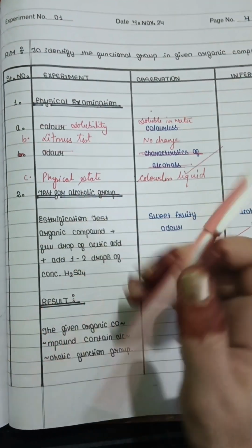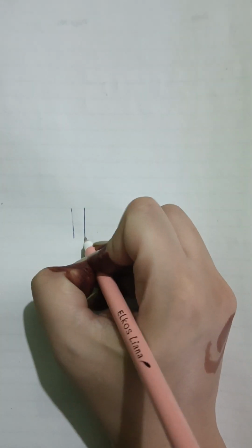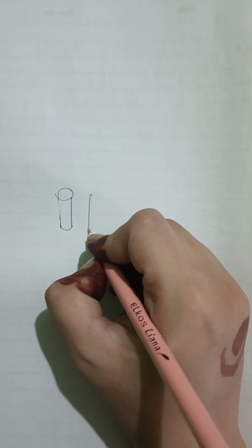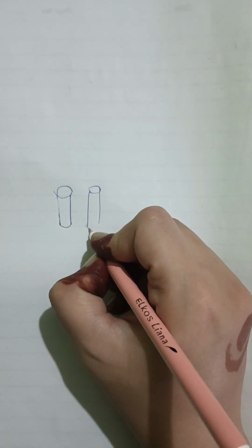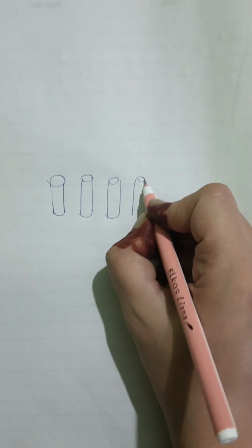See, when you get an organic sample, let's say you have been given four organic samples. These are the most common four organic samples which come in your exam. These are your test tubes.